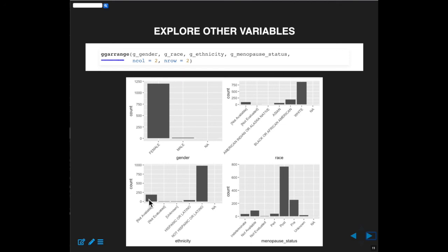And actually, there are some interesting findings here. I didn't know there actually is at least one male sample in our data set. That's the source of variability, I'm sure. That's interesting. I haven't looked at it explicitly, so it's something I would keep my eye open for. I would probably go and get that participant's code and try to memorize it or mark it down, and then be sensitive in the analysis to see if that's showing up often, because it could really be an outlier.